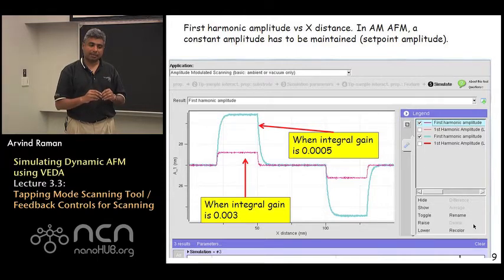That you need to try and avoid by changing the gains on the sample.